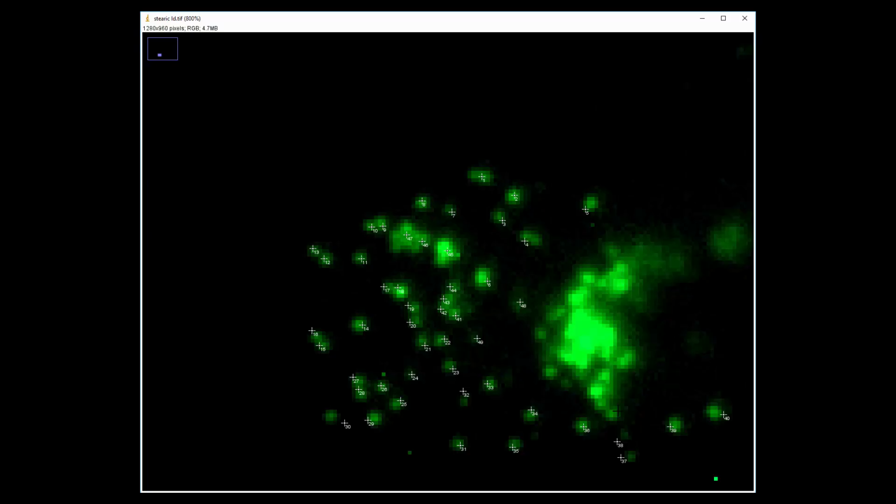Now, what to do about the blobs? All right, this is where it gets a little bit interesting. What I would do is I would purposely try to, equally in every sample. So if you have 2 or 3 different conditions that you're comparing, I would try to be equally biased in whatever you do. So if you're selecting cells and you're doing this measurement, make sure that on each one you're equally biased. So let's say, maybe I wouldn't even pick this one if I saw this. Maybe I just picked one that had distinct punctae all the way through, and I would do that for all of them on this screen, and I would do that for all of them on the other conditions as well.